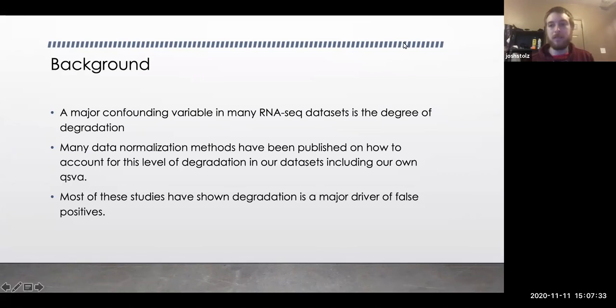But to give a little background, as to why this is relevant, one of the major confounding variables for RNA-seq datasets, and this is everywhere, is the issue of degradation. Both degradation of the tissues and degradation of the actual mRNA itself. And it's not uniform. This is kind of the key part that makes it really difficult is some RNA transcripts degrade faster than others.